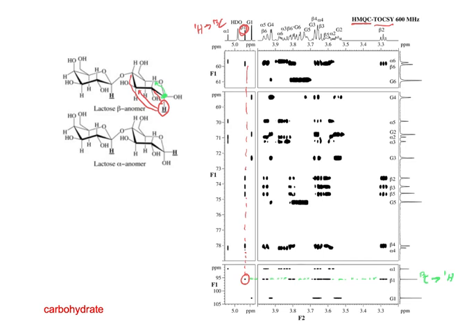So I guess they should be showing similar things. If that's beta 1, and this is showing in the green down there all of the positions in that spin system, then we should be able to go to another signal. So here's beta 2, and if the mixing time is long enough, it should essentially show all of the same protons in that system, or the same carbons as going in the other direction.